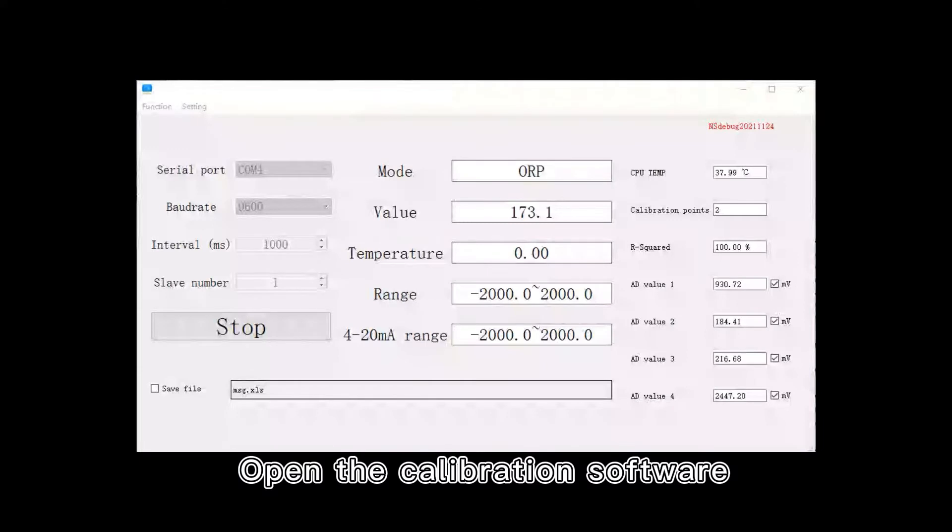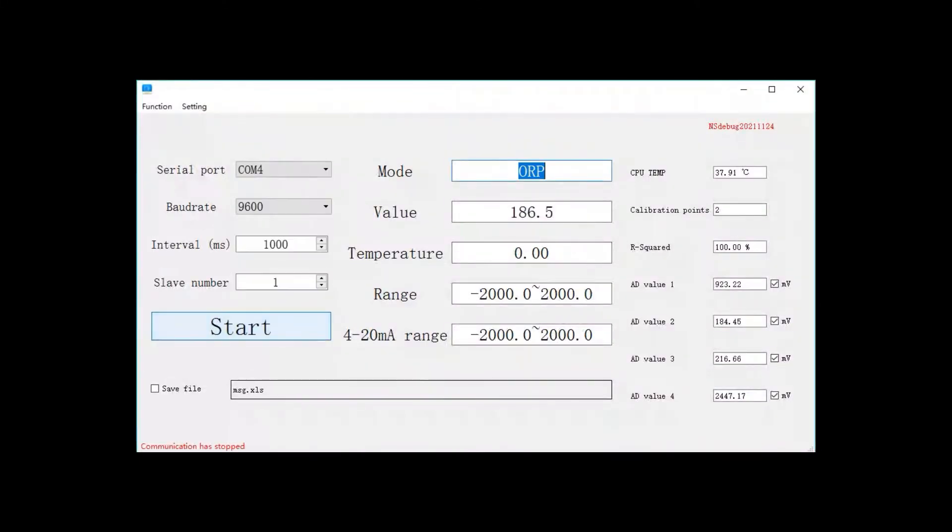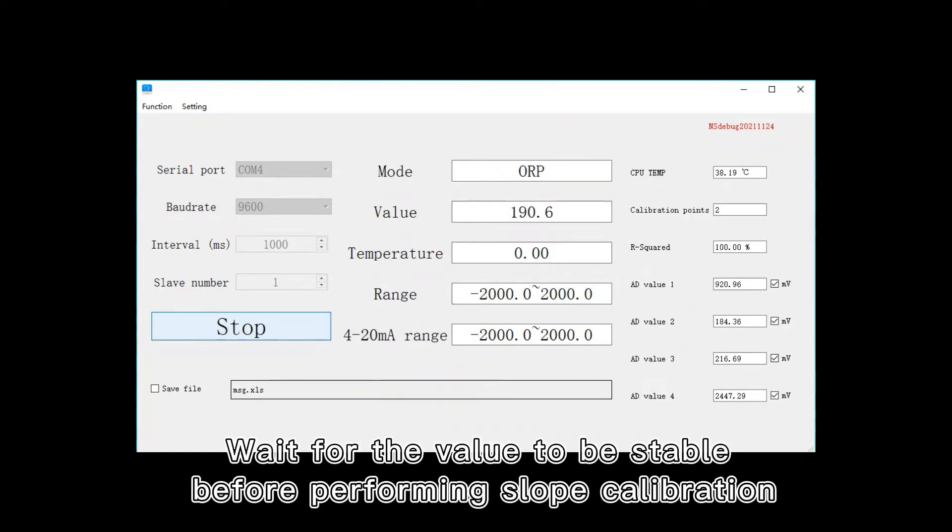Open the calibration software. Wait for the value to be stable before performing slope calibration.